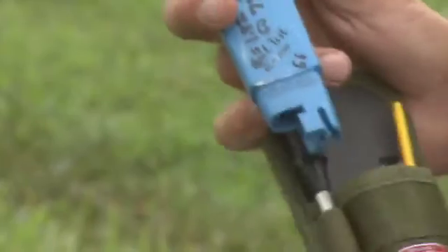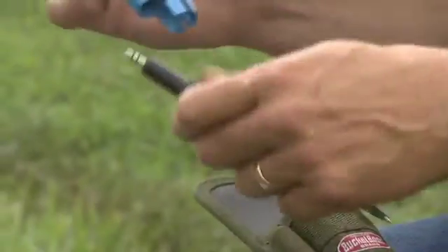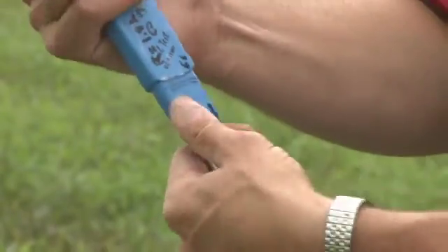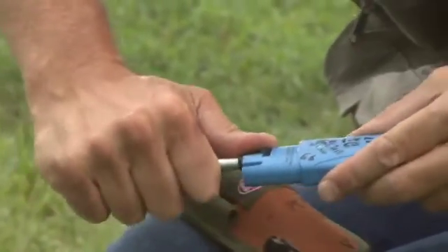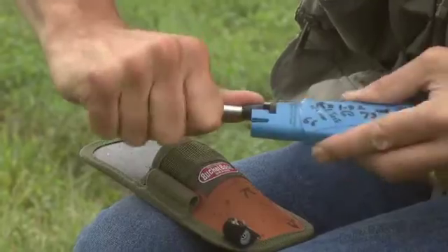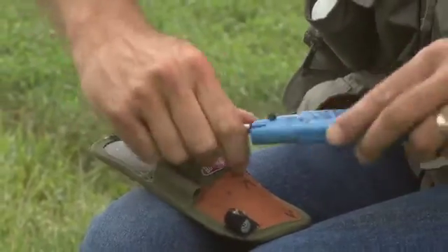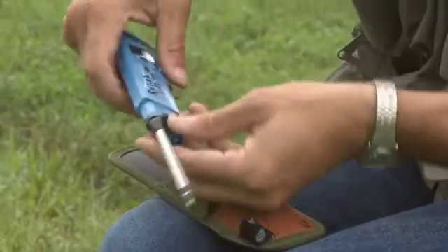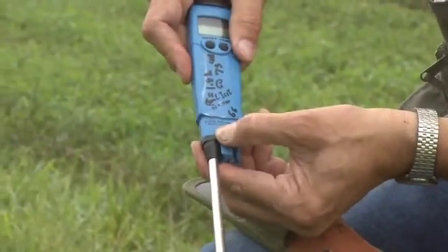The next thing we want to do is take the probe out and we're going to insert it in the bottom. And this is where it gets a little tricky — you need to insert it all the way and make sure that it fits all the way in there. I got it all the way in so it's flush on the front.